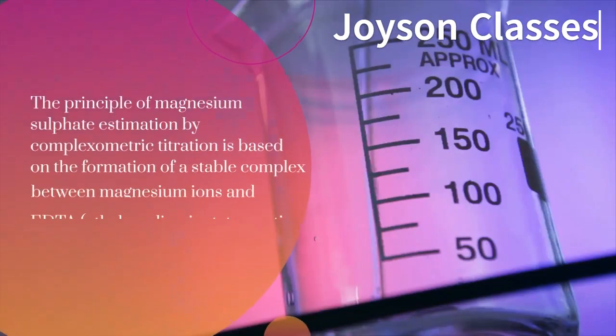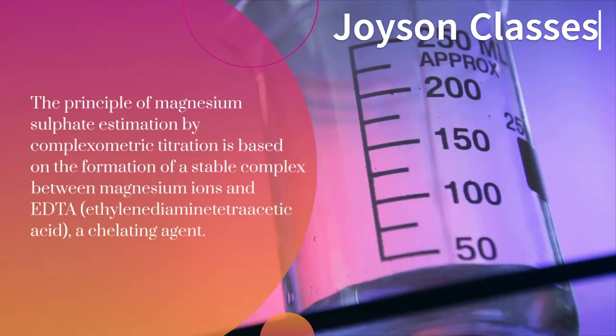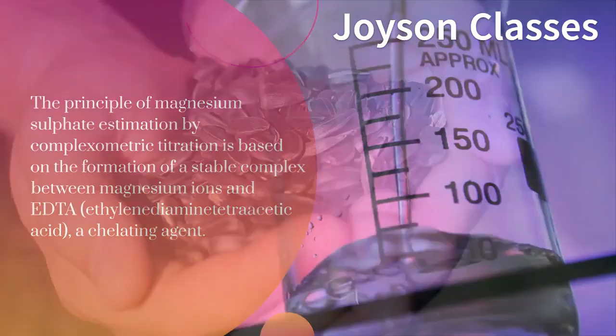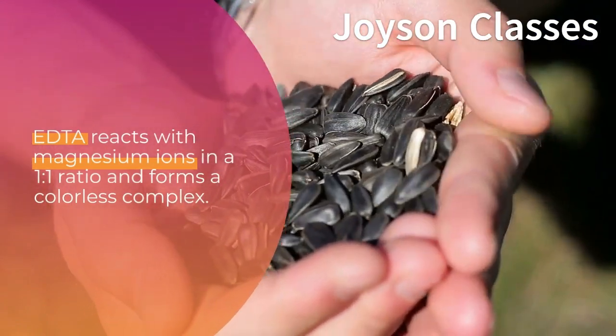The principle of magnesium sulfate estimation by complexometric titration is based on the formation of a stable complex between magnesium ions and EDTA, ethylenediaminetetraacetic acid, a chelating agent. EDTA reacts with magnesium ions in a 1:1 ratio and forms a colorless complex.